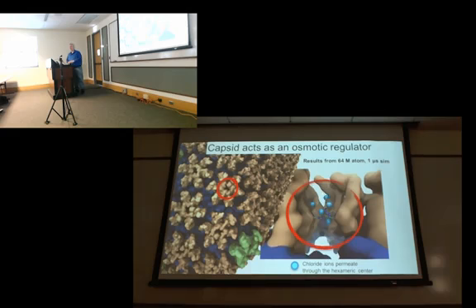You can actually animate the molecular surfaces interactively, which is very exciting. And it's easy to use that in concert with other representations. It can be dialed up or down in terms of how much resolution it gives in the final image. And it's very compatible with other things.